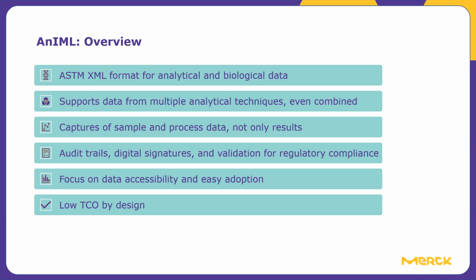It supports data from multiple techniques. So you can use one data format for many different types of experiments, which is quite powerful and gets us decent reuse of our tools. And we can even combine different techniques in one experiment, in one data format, and visualize using the same tool, which is another very powerful capability.